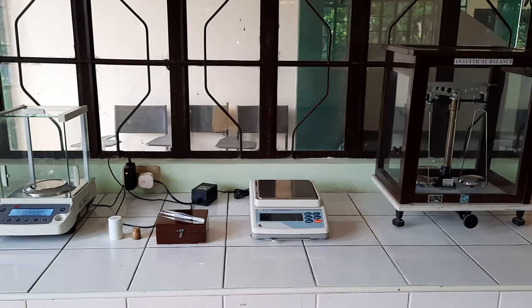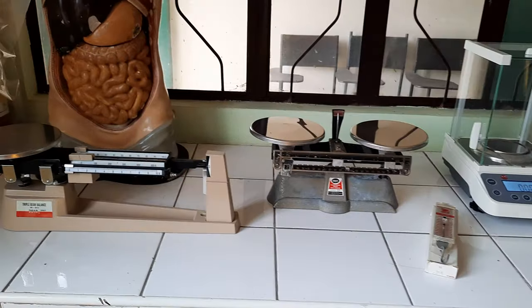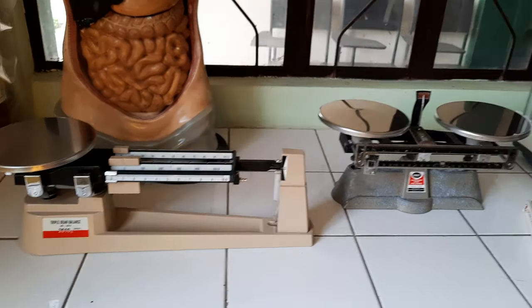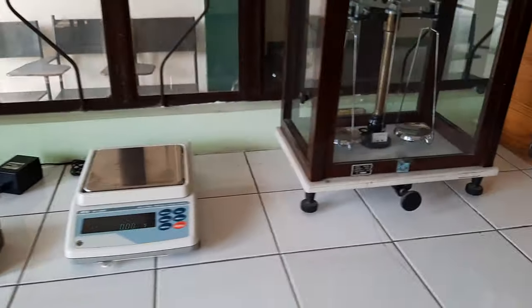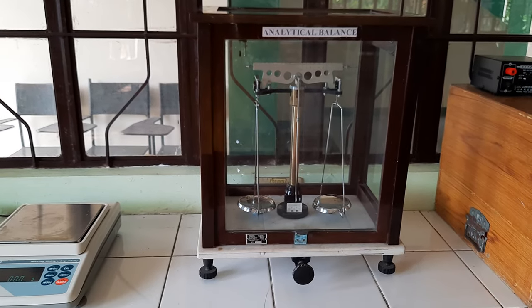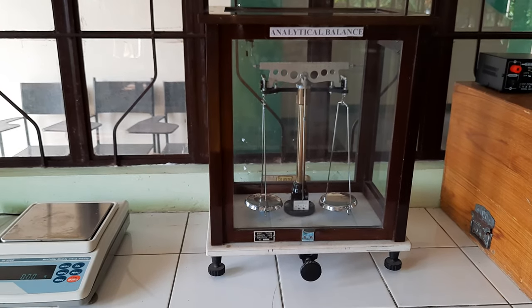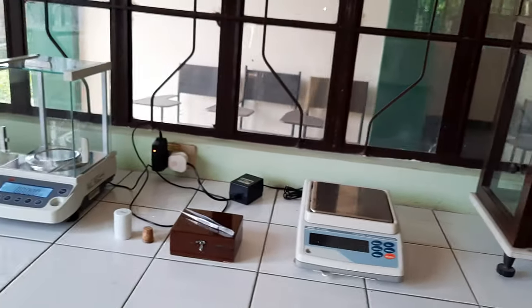Good afternoon class. Welcome to our another YouTube video compilation for the Binal Bagan Catholic College Science Laboratories. Today I will be featuring our equipment or devices used in measuring weights or masses of substances or materials used in different science experiments.